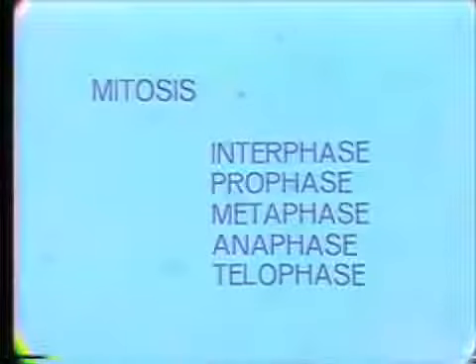Now viewed in the microscope are several cells. In prophase, these chromosomes duplicate and become very obvious in the stain preparation. These are the darkened, duplicating chromosomes. Recall that the chromosomes are made up of desoxyribonucleic acid.